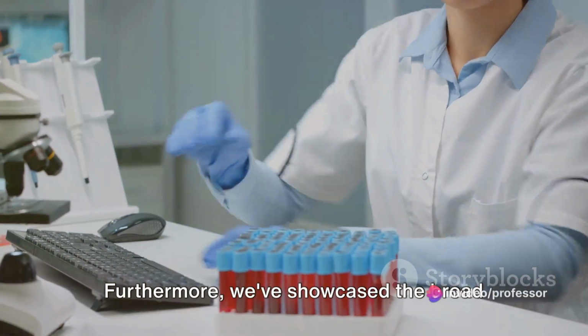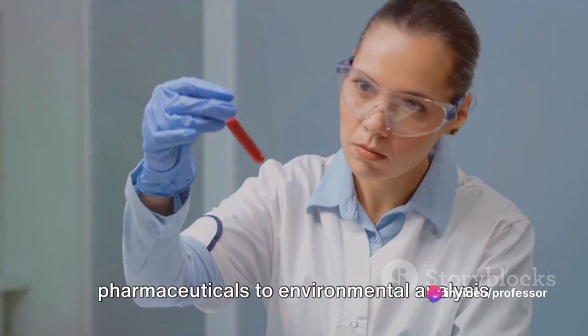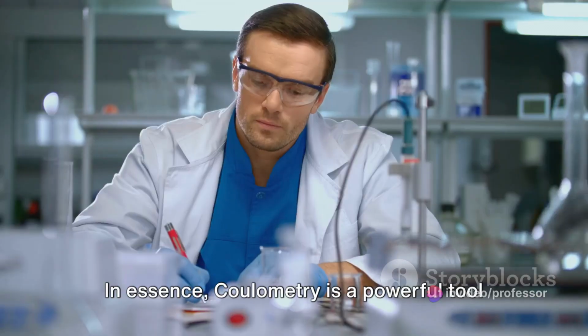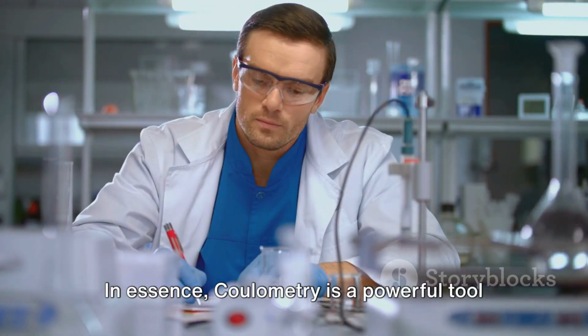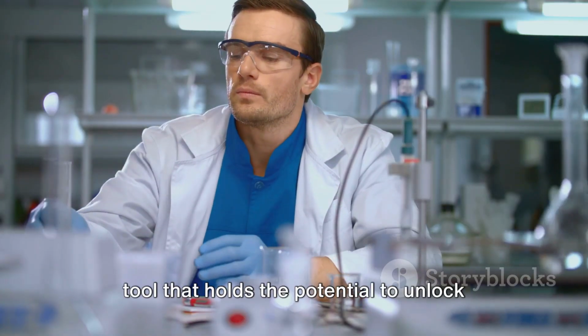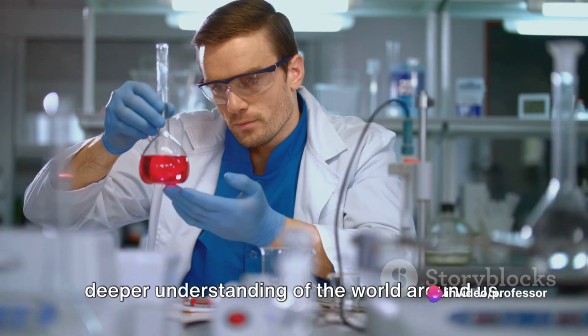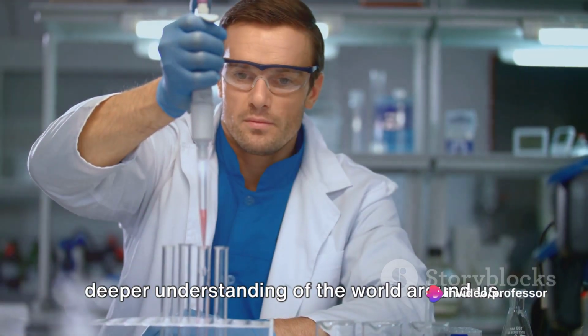Furthermore, we've showcased the broad applications of coulometry, from pharmaceuticals to environmental analysis and quality control. In essence, coulometry is a powerful tool in the field of analytical chemistry, a tool that holds the potential to unlock new frontiers and propel us towards a deeper understanding of the world around us.